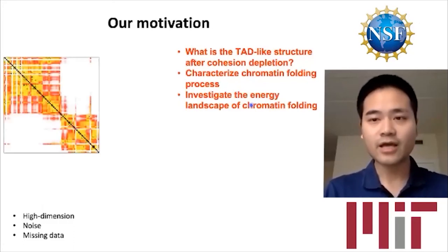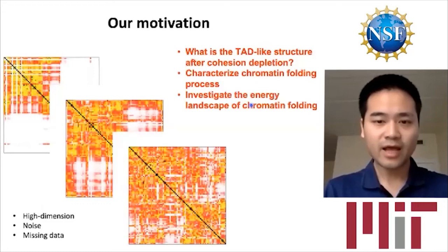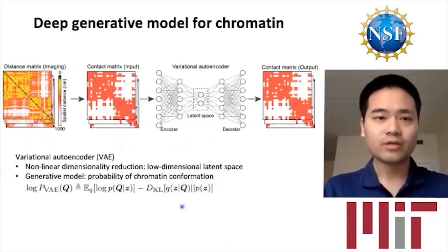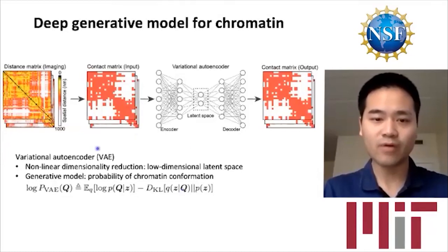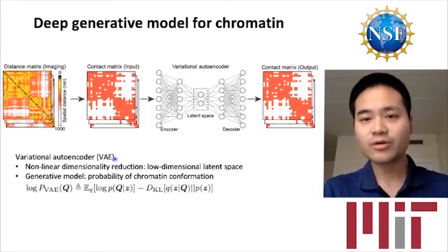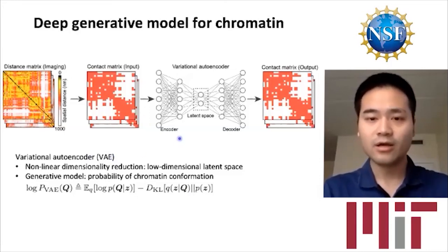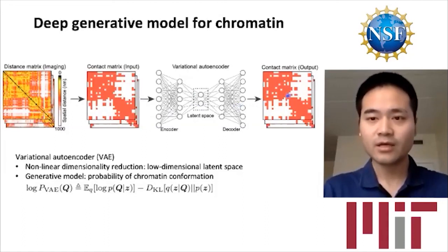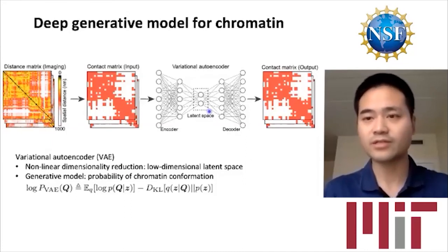So the imaging data is high-dimensional, noisy, and many times contains missing data. How can we analyze it? In our case, we adopted a deep generative model called a variational autoencoder. The variational autoencoder has this kind of neural network architecture. It is composed of an encoder and a decoder. The encoder compresses the inputs into a low-dimensional latent space, and the decoder tries to reconstruct the image itself. In this way, the variational autoencoder first performs a nonlinear dimensionality reduction task. It gives us a low-dimensional latent space, which could give us an intuition about the chromatin organization.